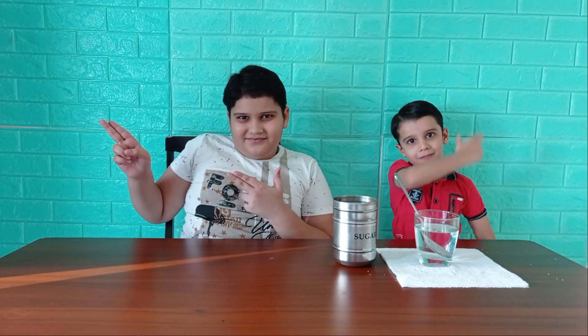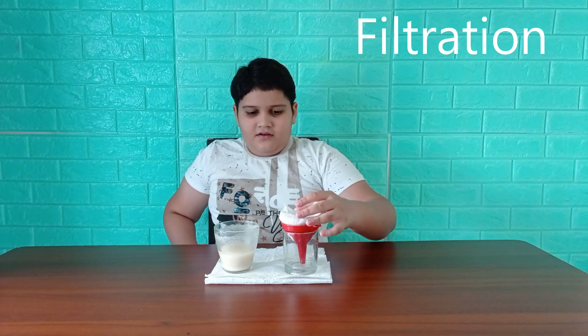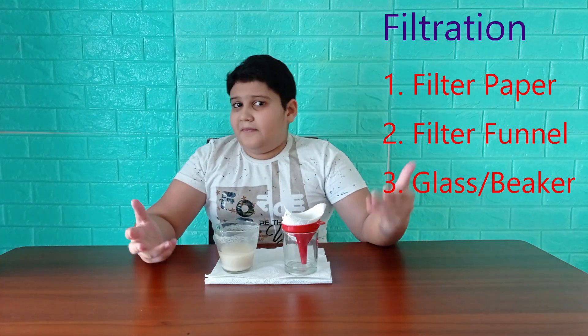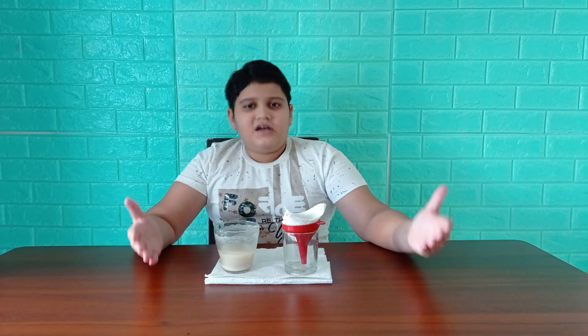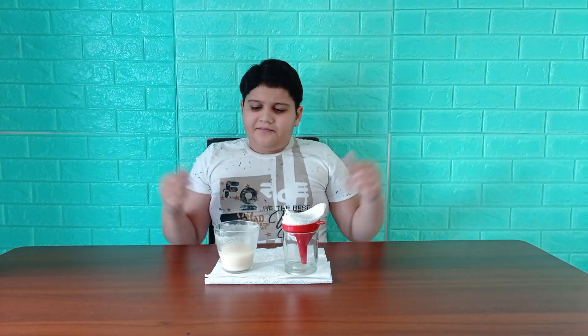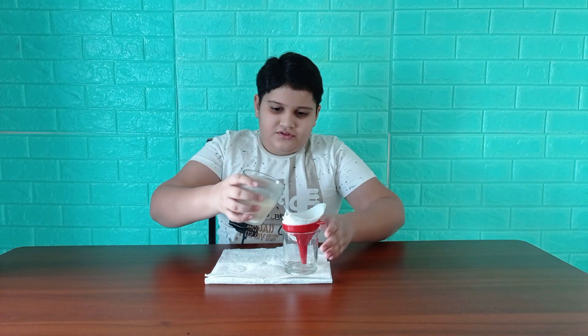Here I have a mixture of flour and water. So how do we separate it? We can separate it by the process of filtration. The things we need are filter paper, a filter funnel, and a glass — some people may use a beaker or a conical flask — just for collecting the filtrate, which is the filtered water.